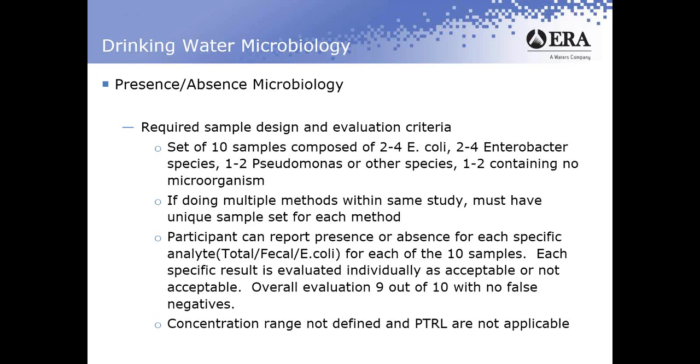The table also specifically tells you, or does not tell you, the concentration range for these sample designs. So there is no guidance given to the PT providers as to how concentrated or how dilute those samples may be, and also there is no proficiency testing reporting limit listed on the table. It's considered to be just a presence-absence sample. No quantitative information is actually described for the providers.